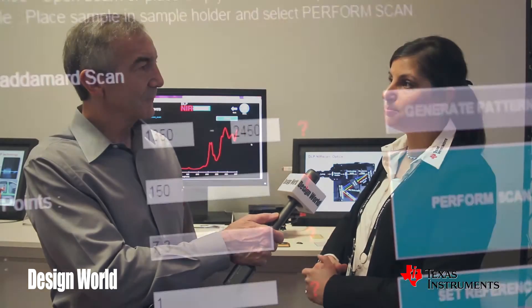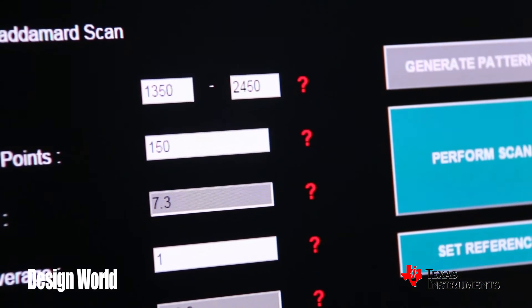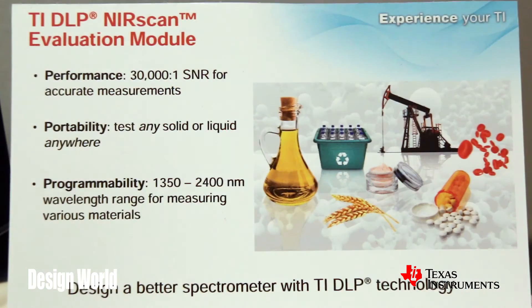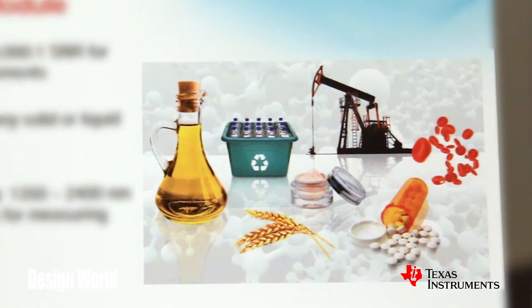What about the range of wavelengths this thing could be sensitive to? DLP chips commonly used in displays tend to range in the 420 to 700 nanometer range, which is visible light. We offer a DLP chip solution that ranges from 700 to 2,500 nanometers, commonly referred to as the near-infrared range. In this range, it becomes very useful for the spectroscopy market because different components in the pharmaceutical, food, and oil and gas industries have materials that are detected in the near-infrared range.